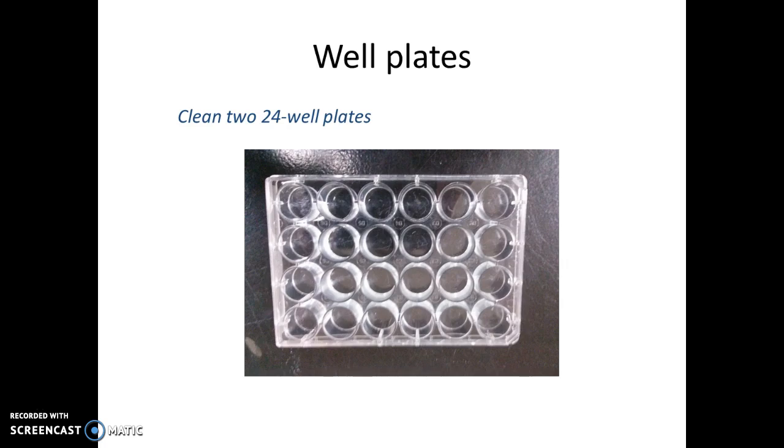The first thing that you want to do is get two 24-well plates, and you want to wash these thoroughly with soap and water and do a final rinse with deionized water. We reuse these plates, so it'll be important to wash them before you start your experiment.